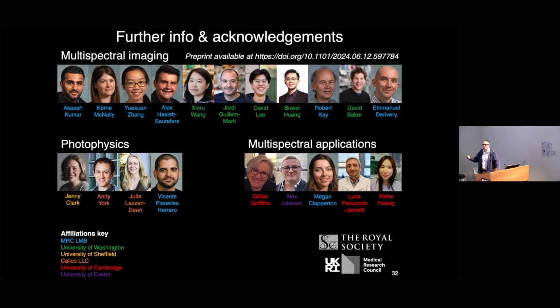For changing the photophysics from StayGold to StayGolder, are you editing the molecular structure of the actual chromophore itself, or are you changing the electronic environment slightly around the chromophore, or a bit of both? So we've tried both.